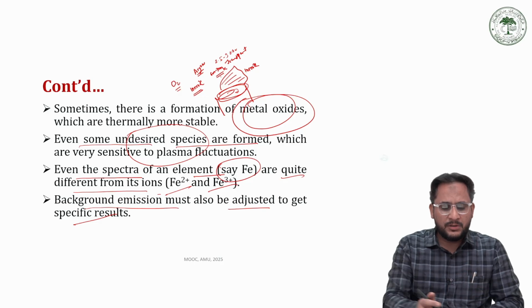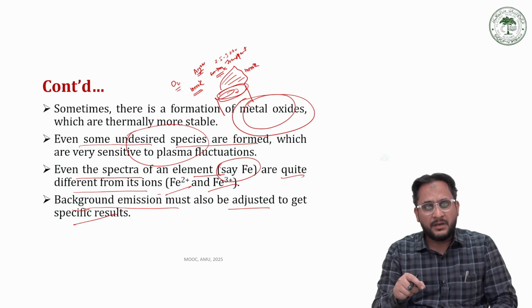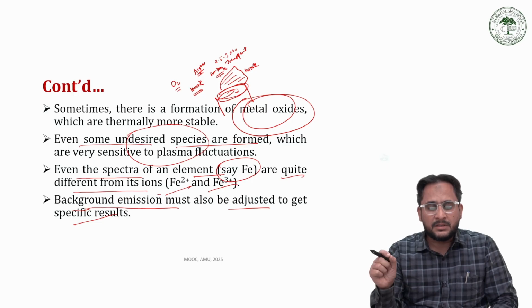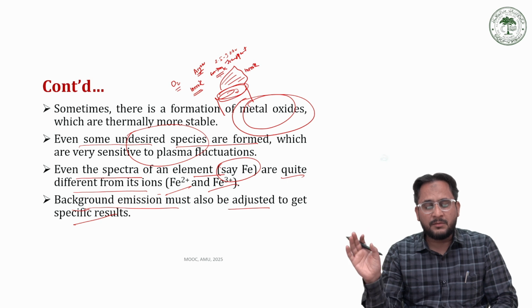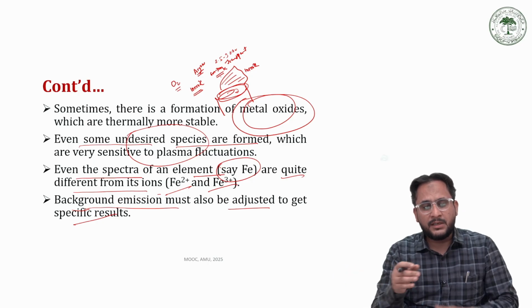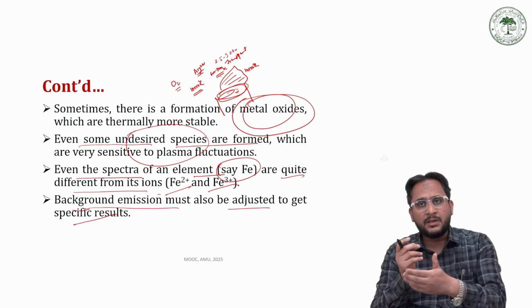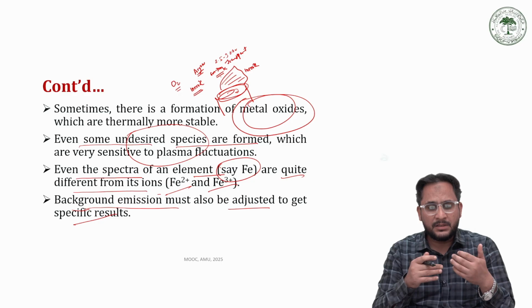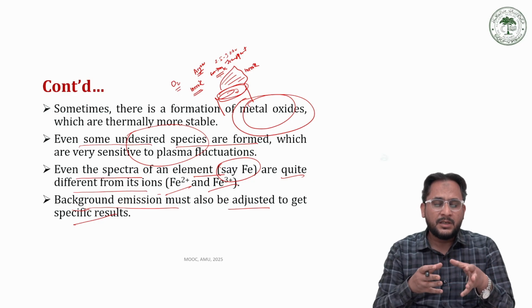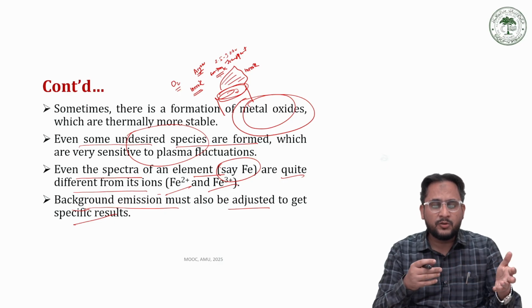So in order to reduce this background emission, first, without any soil matrix digested, the pure acid should be injected to create a background spectrum. Then the acid is used for digestion of the soil matrix, and finally the filtrate is injected, so that in the second run we subtract or exclude the background emission. Background emission always causes interferences, and it can only be reduced or avoided by doing a blank run and then excluding those background emissions.